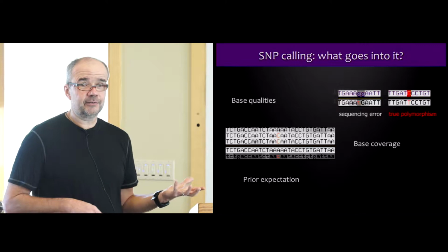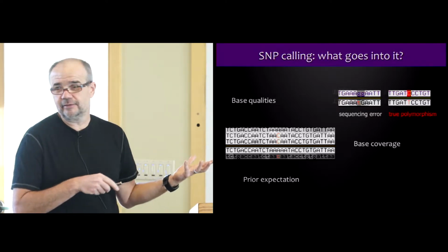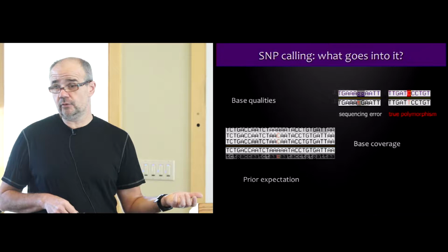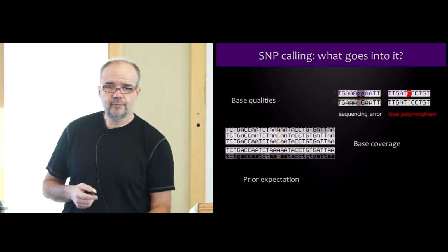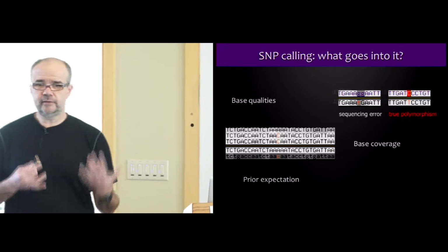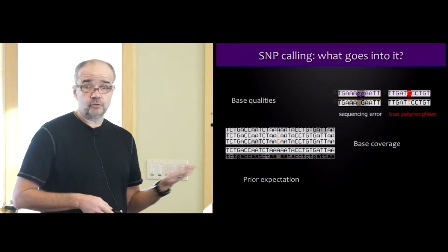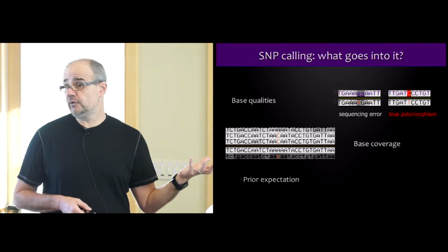Okay, without insulting your intelligence, it's obviously this example here. And in this case, it is more likely that either the G or the T is a sequencing error. Right, and that's why we're seeing this difference. So that's really the big decision that you have to make when it comes to small nucleotide changes. Are these differences that we're seeing true polymorphism, or are they just measurement errors? Is it sequencing errors?